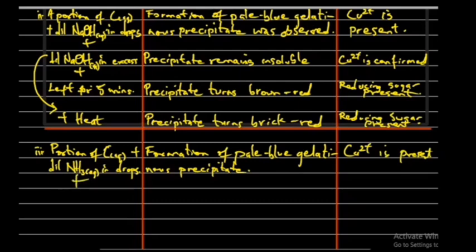And then, in excess aqueous ammonia, we discovered that the precipitate dissolves to give a deep blue solution.